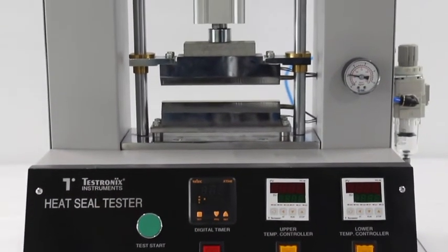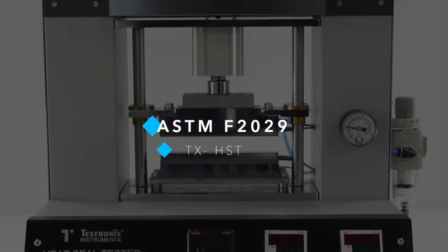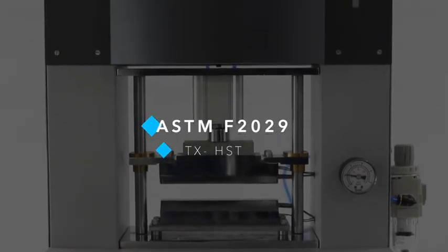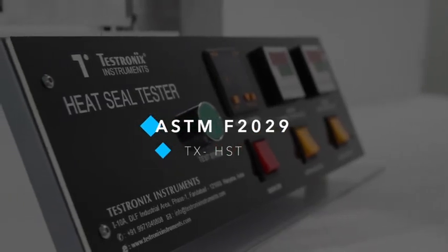The instrument complies with ASTM-F-2029. The TX-HST is a great entry model heat seal tester.